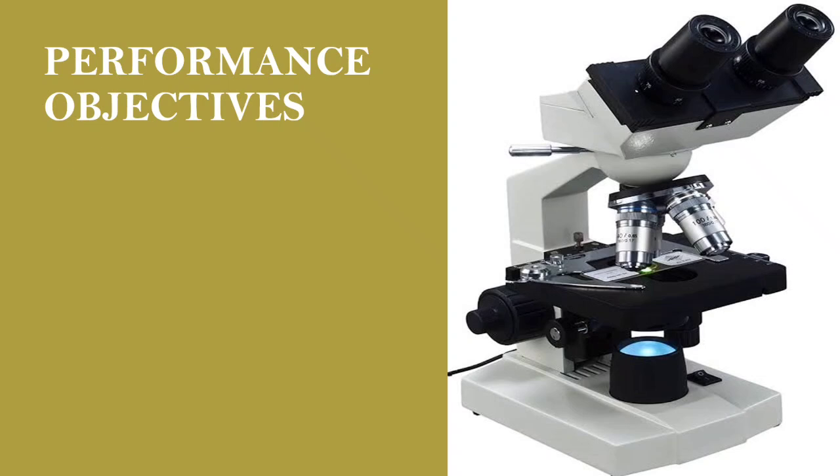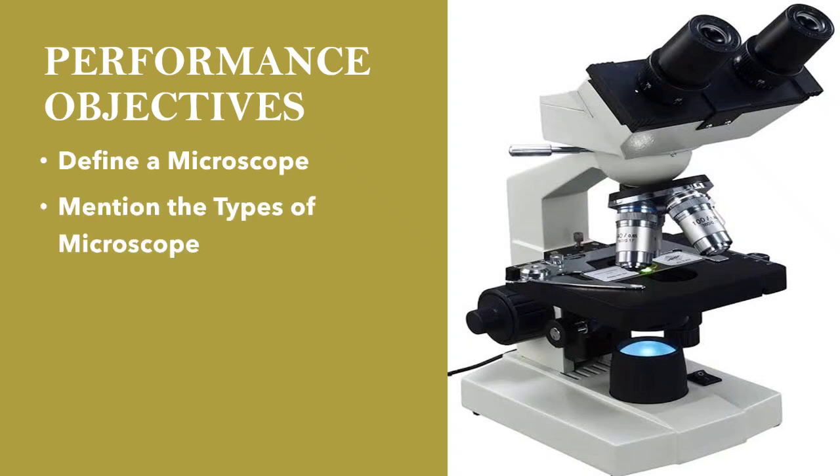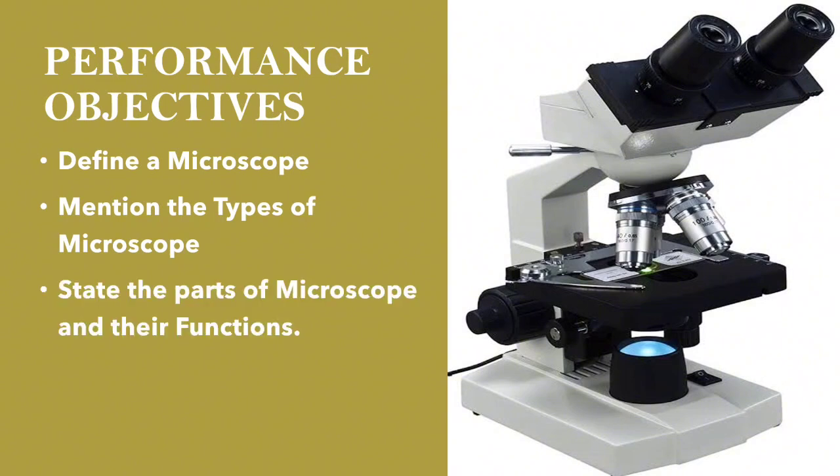In this video today, we'll be defining a microscope. We will mention the types of microscope, okay? Because we have different types of microscope, but I will not exhaust everything in this video. I'll just mention a few, all right? And then we'll state the parts of microscope and their functions. We'll also state the importance of microscope. So join me and let's journey this lane together.